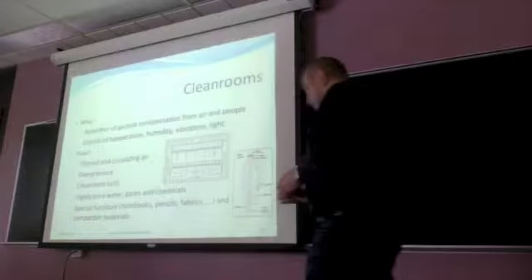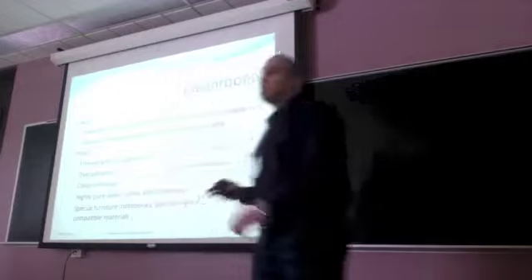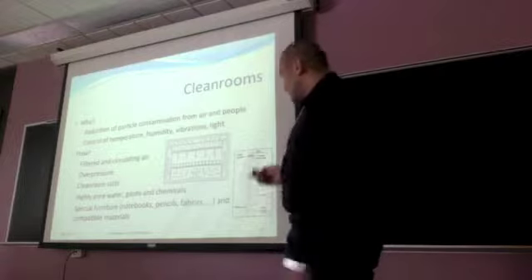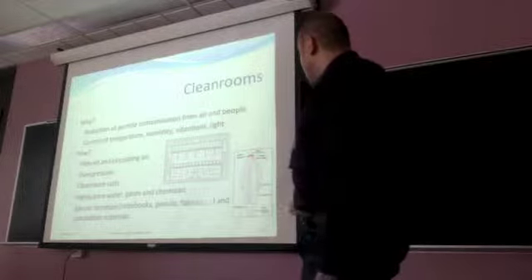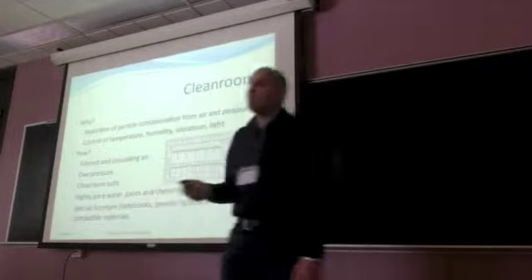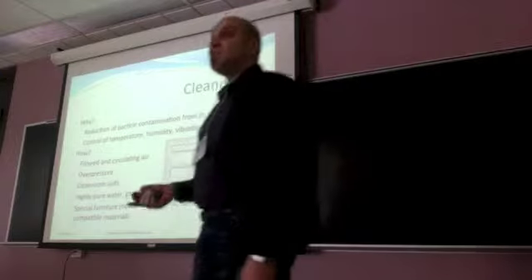How is it possible? In clean rooms, air continuously circulates and is filtered. Positive pressure is applied to keep particles outside the clean room. The users have to wear clean room suits, which consist of a hood, safety glasses, coverall, gloves, and boots. Liquids, gases, and chemicals also have to be highly purified because they will be in contact with silicon wafers and other semiconductor substrates. And special furniture is also needed inside to prevent any particle spreading inside the clean room.